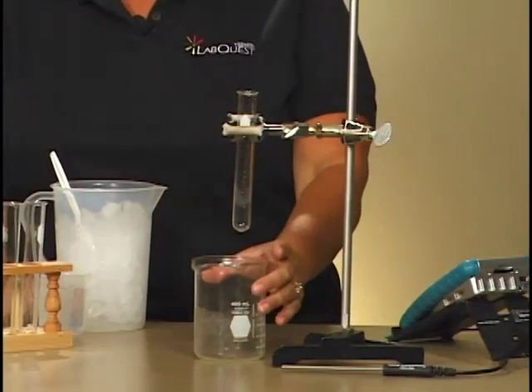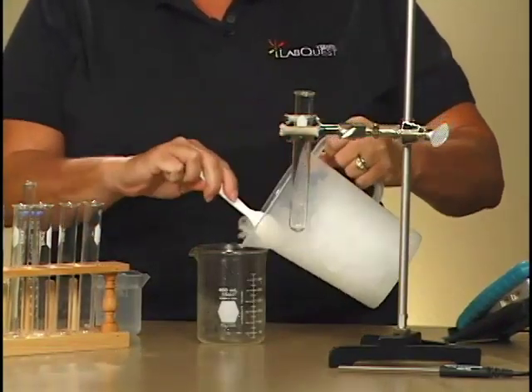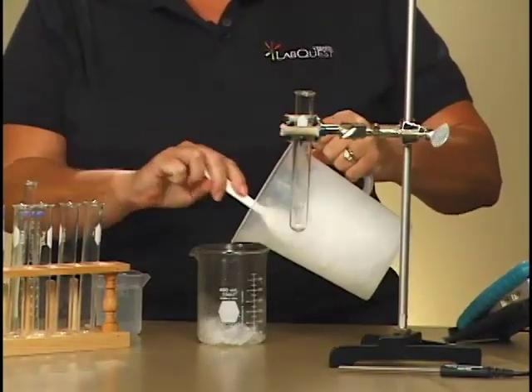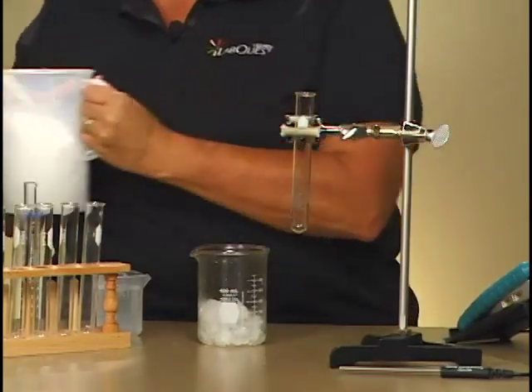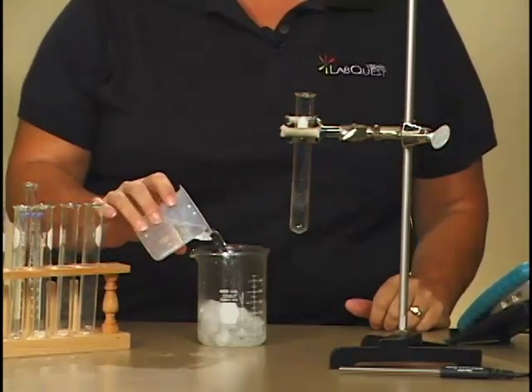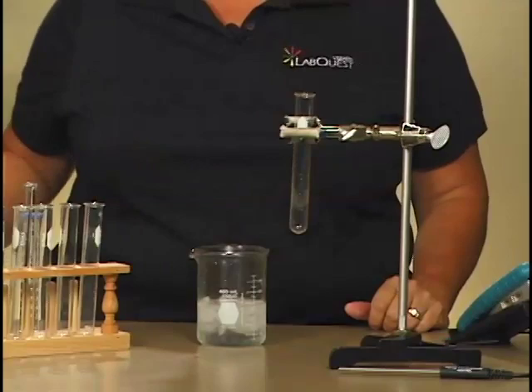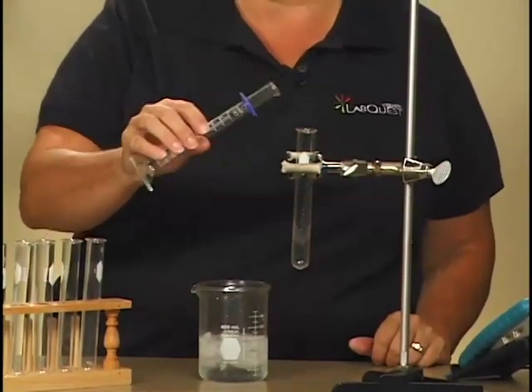Start by filling a 400 milliliter beaker approximately one-third full with ice. Add 100 milliliters of water to the beaker. Add 5 milliliters of water to the test tube.